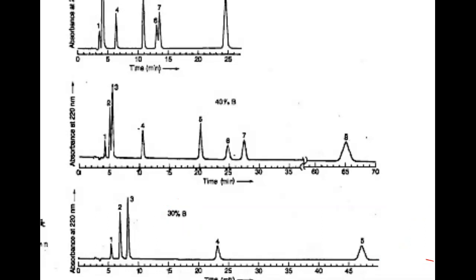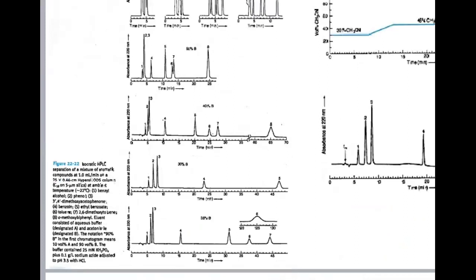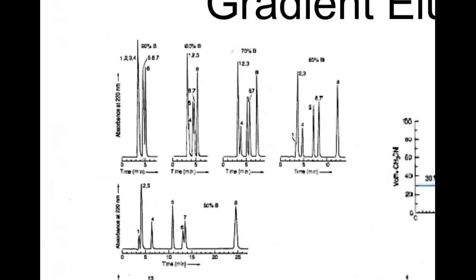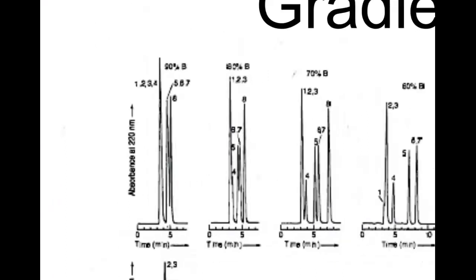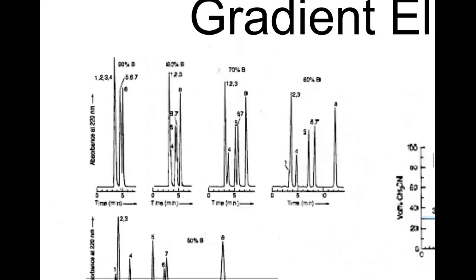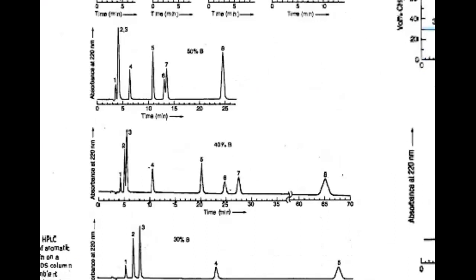So we can see that the percentage of acetonitrile, solvent B in this case, really has dramatic effects on the separation, right? Originally, when it was 90% B, those peaks just washed through the column really fast. Things were not retained much because they really like to dissolve in the acetonitrile. But as we reduce the percentage of that substance in our mobile phase, remember that's a mobile phase component, what happens?